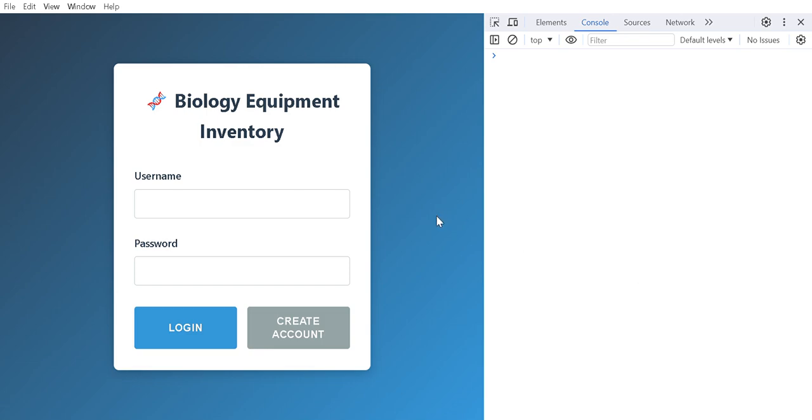Hello, in this video we will be going over my biology equipment inventory and then going over potential extensions I can add on later on to this program. So I will be creating an account right now.